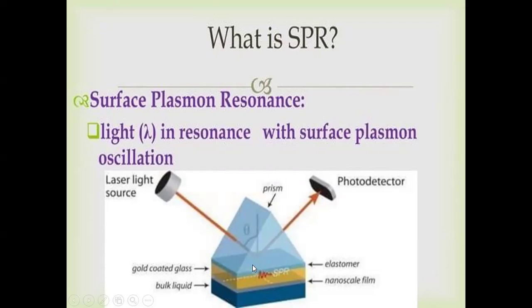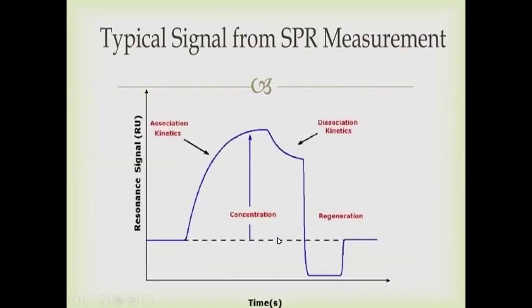And what happens is that there will be an angle of deflection, which will be detected by a photodetector. Any analyte or enzyme or antibody that you have to coat will be coated on the surface of this metal, and the deflection angle will be noted. This is the signal you get from SPR. These detectors are usually connected to a data visualization point, that is a computer system, where you can analyze the concentration of analyte that is reacting.